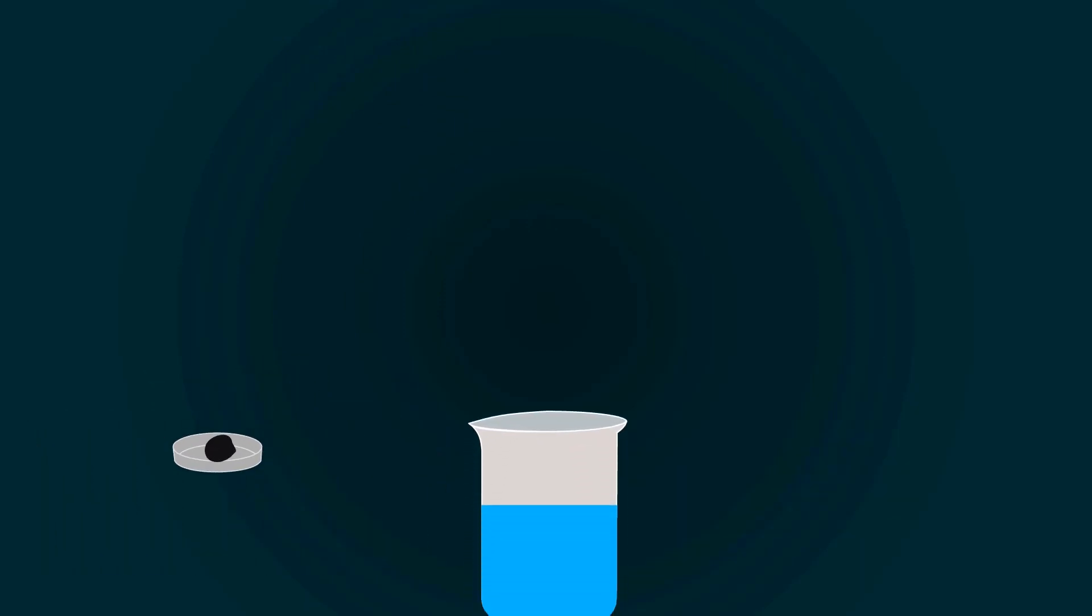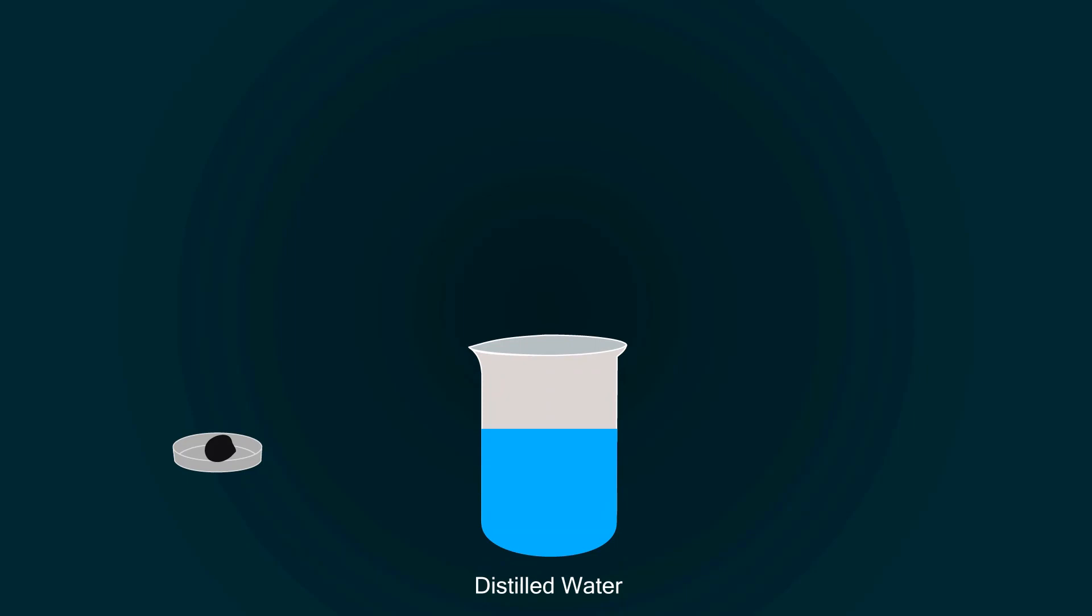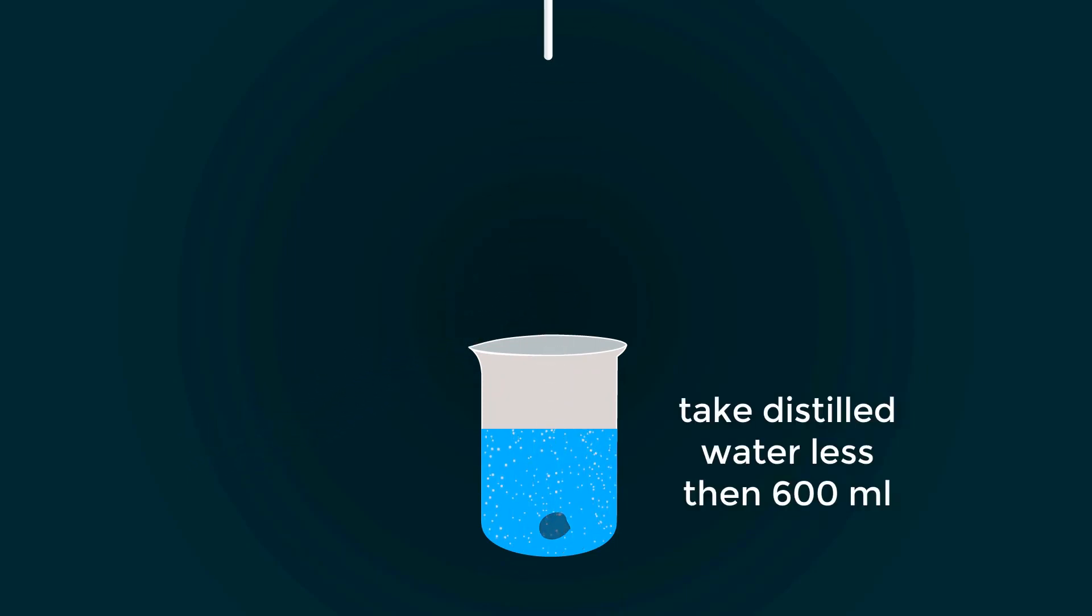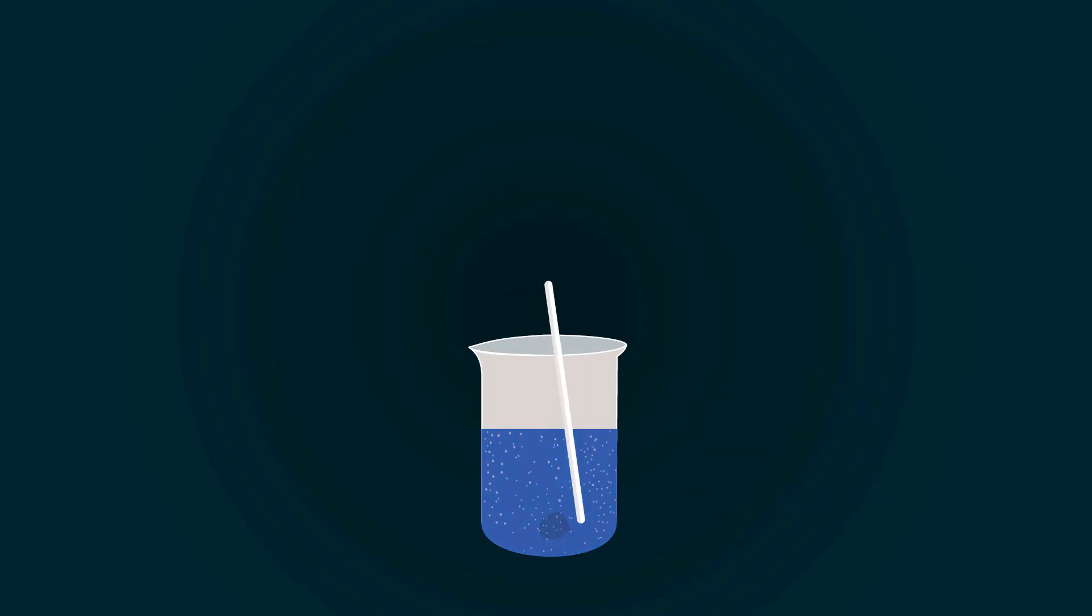Now add the potassium permanganate into the distilled water. You can take distilled water up to 600 milliliters for mixing. You have to make a homogeneous mixture.